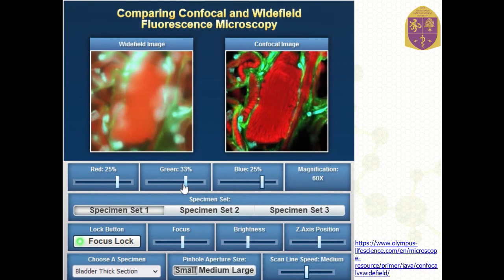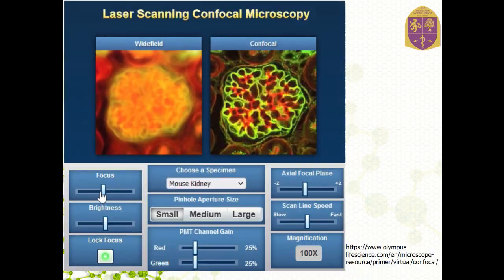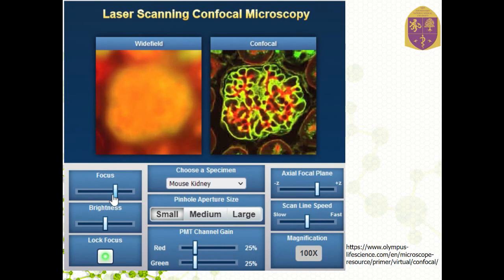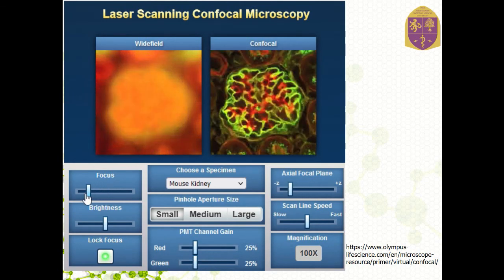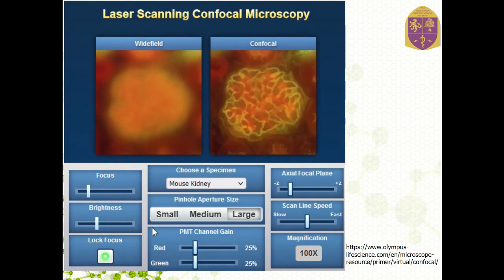There are options to change the placement to get practical skills of adjustment on different specimens — for example, how to explore the kidney of a mouse, and how the image will change if you change various parameters.